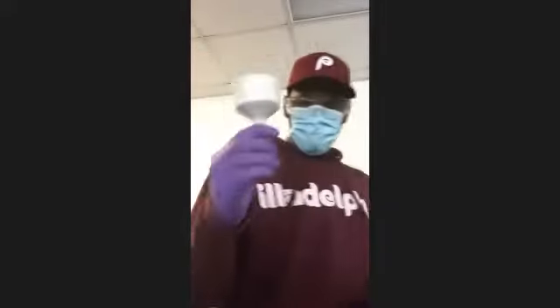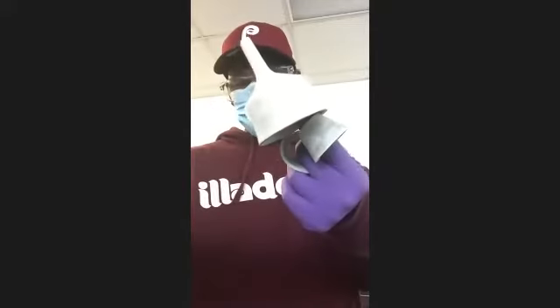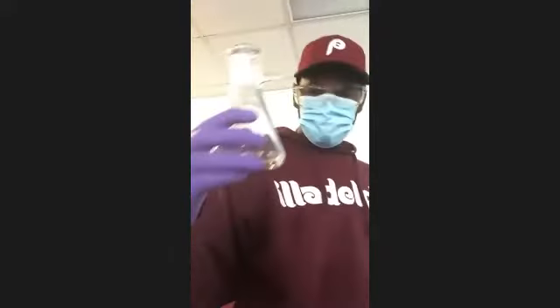So for the setup for your filtration, you need a Buchner funnel. It's this little ceramic funnel right here. I'm gonna send y'all a video too, because I got a video with the glassware on it. So you can at least have that. But you need a Buchner funnel. You need a filter flask, which is this.